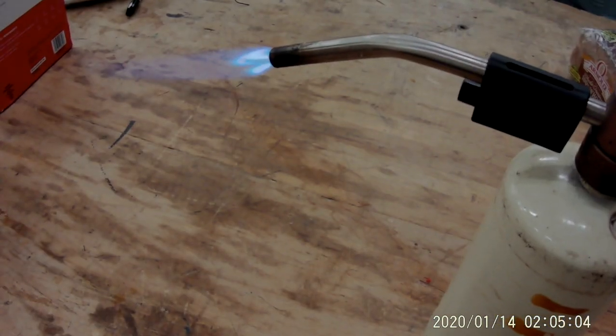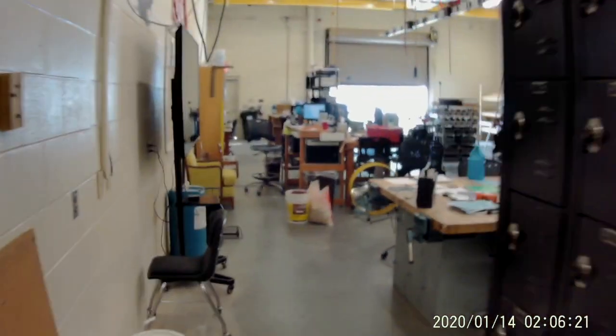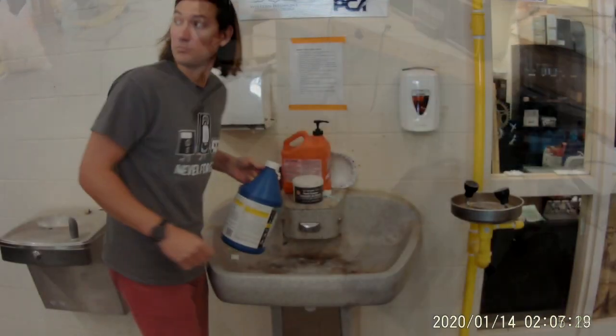Do not bring any substance in contact with a flame unless specifically instructed to do so. Only laboratory manuals and laboratory notebooks are permitted in the working area. Other books, purses, book bags, and such items should be placed in your desk, locker, or storage area.